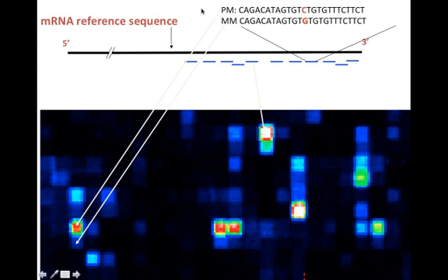Now, one observation that was made early on was that there was background noise. This comes from cross-hybridization, from the scanner optical noise, and from other factors. What made it particularly difficult is that the background noise levels were probe specific. So every probe appeared to have different amounts of background noise. So Affymetrix designed a probe just to measure the background noise.